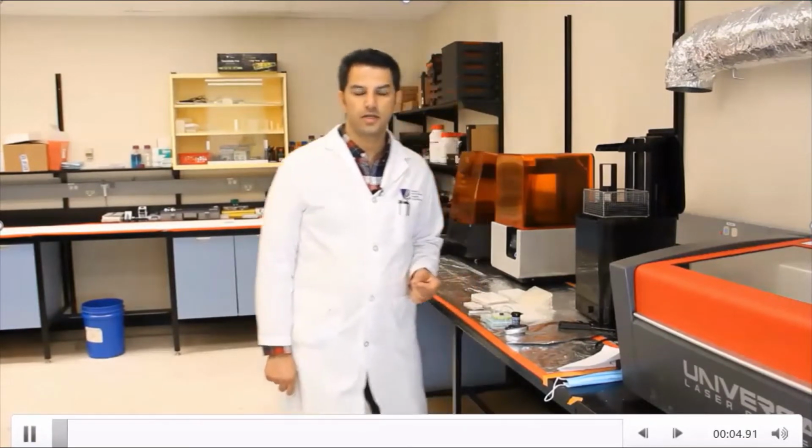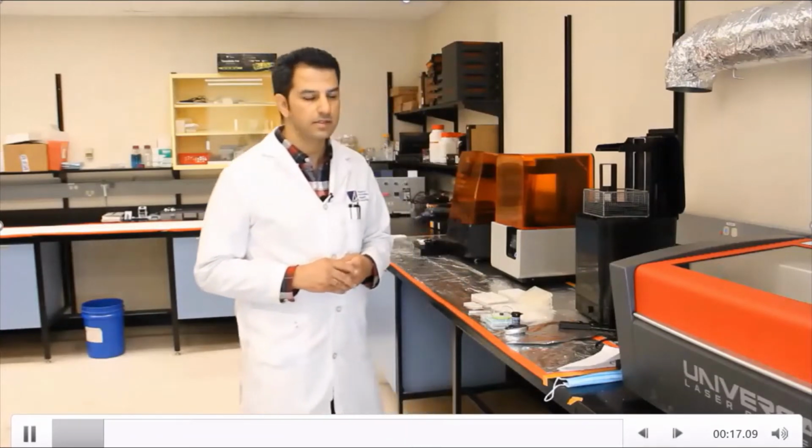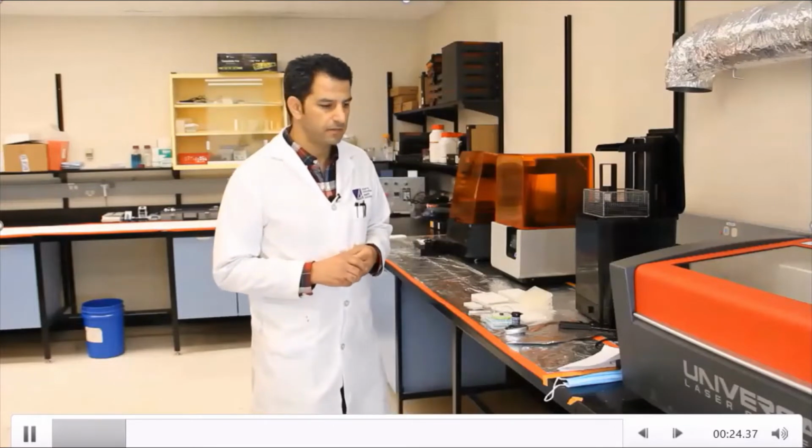My name is Mehdi Mohammadi, a postdoctoral researcher and lead engineer at Lewis Research Group, University of Calgary. Different types of biosensors have been developed over the last 20 years, from optical sensors, physical sensors, and electrochemical sensors. And today I want to briefly talk about electrochemical sensors, which are divided into 4 main groups for detection: amperometric, voltammetric, potentiometric, and impedimetric measurement.